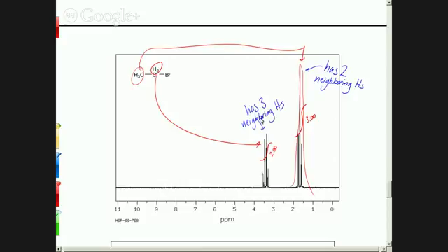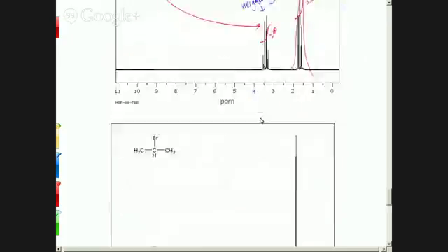The other way that we can confirm that our assignment is correct is that the 2 hydrogen group is shifted further to the left, further down, that's called downfield, the higher numbers, which means that those hydrogens are more deshielded. Those electrons are being pulled more away from the nucleus than the others. And that makes sense because those are the ones closest to that bromine, and the bromine is doing that pulling. So the hydrogen nuclei closer to that bromine are going to be more exposed to the magnetic field, more pulled away. All right, let's look at some other spectra and see how they look similar.